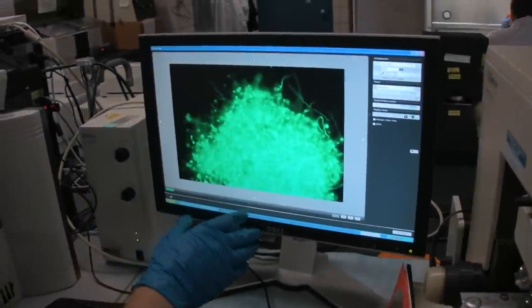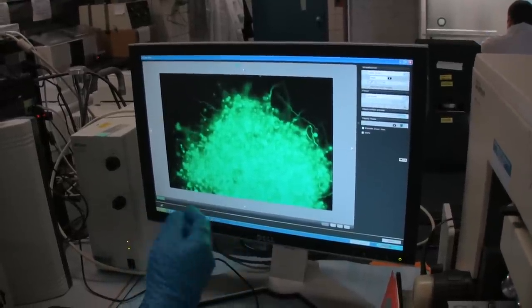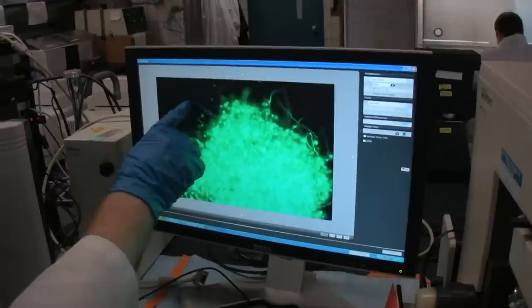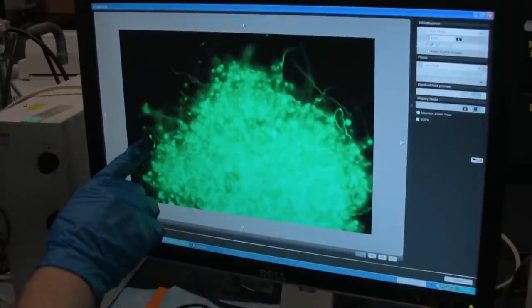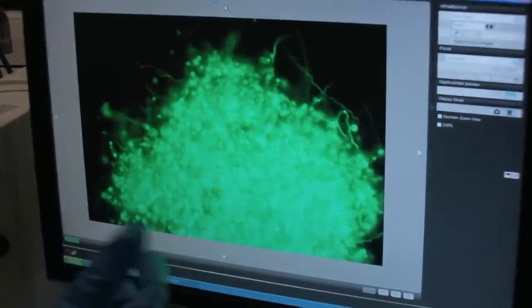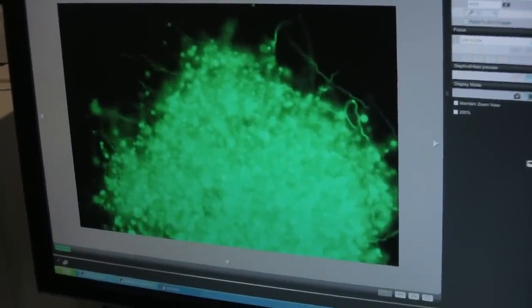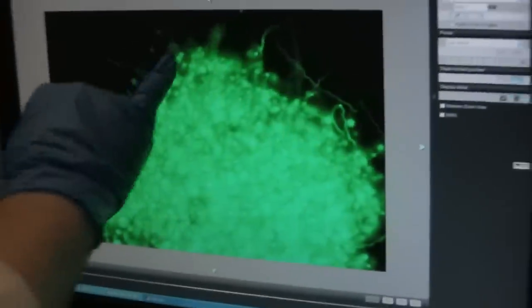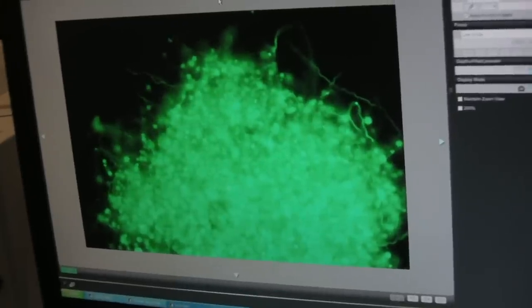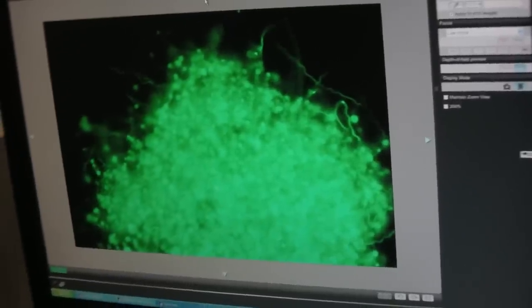The GFP Borrelia has been specially genetically engineered in order to produce the protein, so the only things you're going to see glowing here are the things that are certainly Borrelia. It's all Borrelia that you're seeing that's glowing. So not only are the spirochetes expressing this protein, but these balls, the cysts, are expressing it too. Those have to be genetically related to everything that's here and to here. They're all expressing the protein. So unquestionably, everything you're seeing here is Borrelia. Everything is glowing. These little pieces that you're seeing moving, the larger cyst balls that you're seeing moving, everything that's glowing is expressing the protein, and everything that's expressing the protein is the GFP Borrelia.